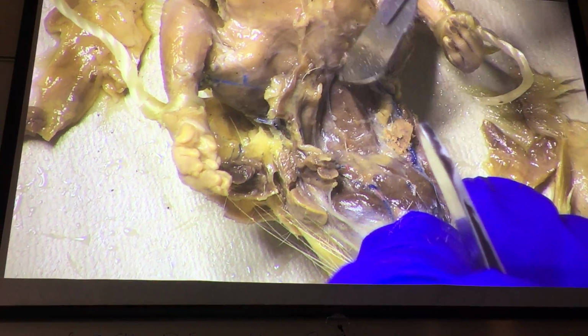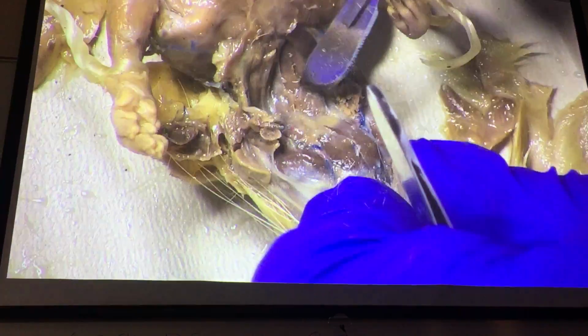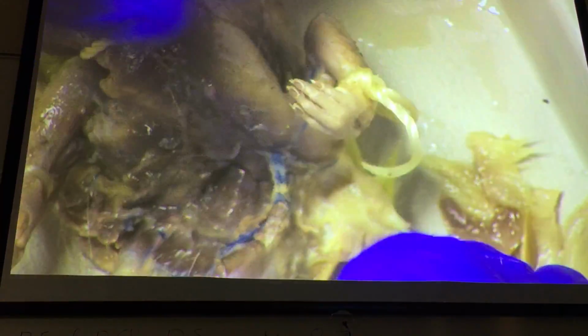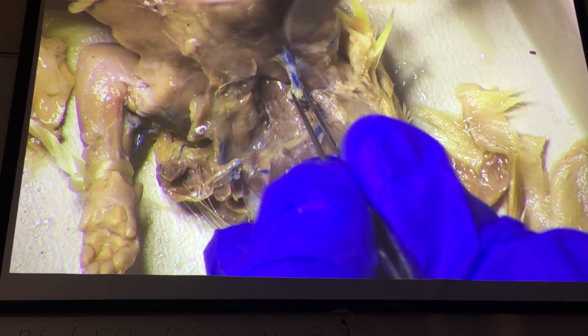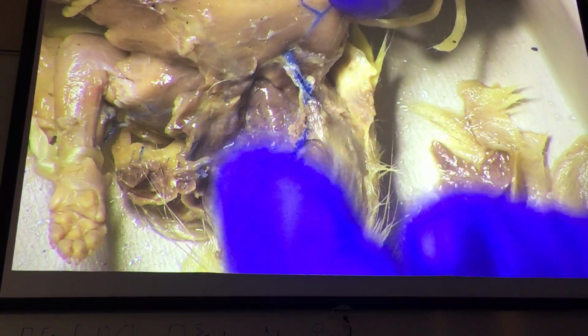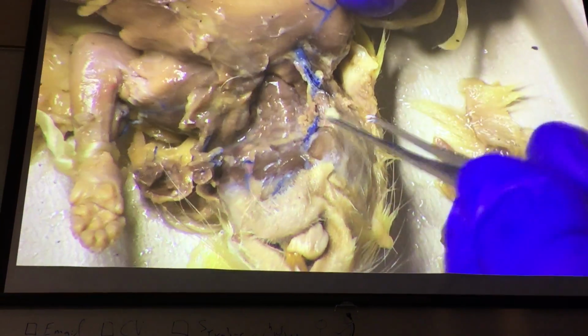But now on this side, we can see our sternomastoid, sternohyoids. Then getting in here off to the side, we have one of our trapezius muscles, right? And of course, that trapezius muscle is going to be the clavotrapezius, which we have right here alongside the external jugular.